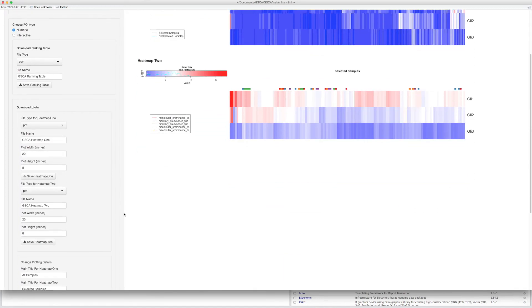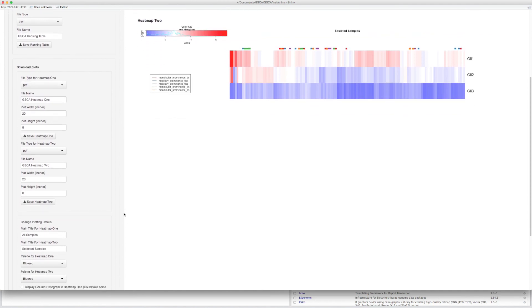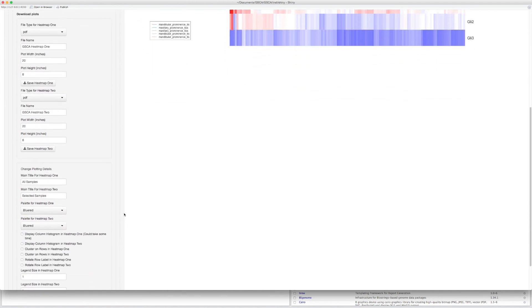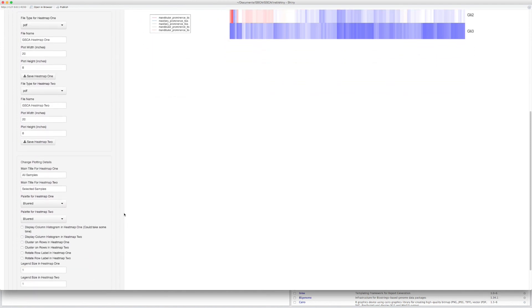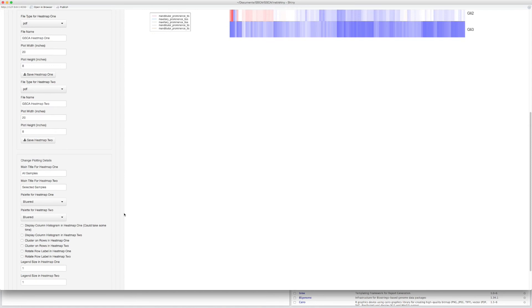You can customize your heatmap by changing color palettes, adding row or column dendrograms, rotating row labels, and changing label size.